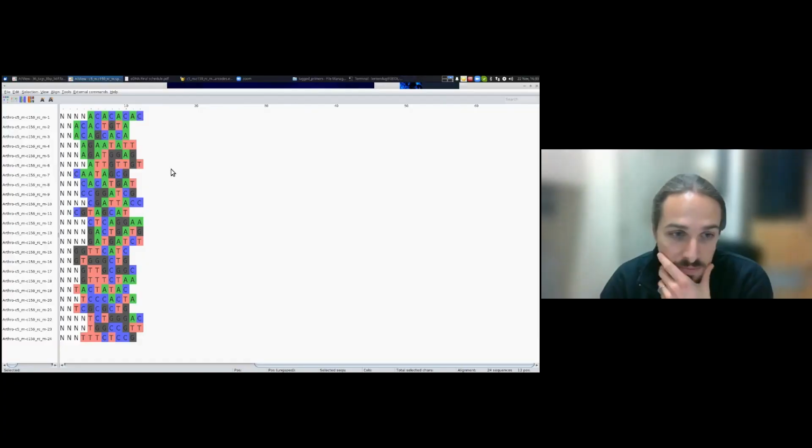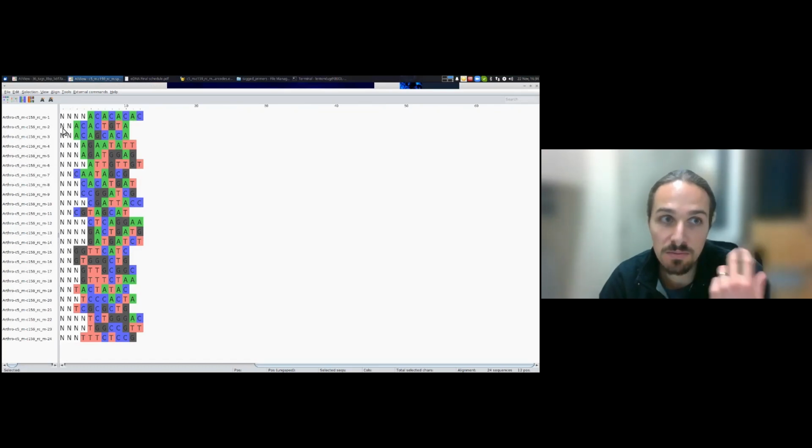That's also a way to select your barcodes. So that's actually the heterogeneity spacer: when you order the primers, the Ns are changed by the company with A, T, C, and G, so you will have as much A, T, C, and G at that position for this primer.